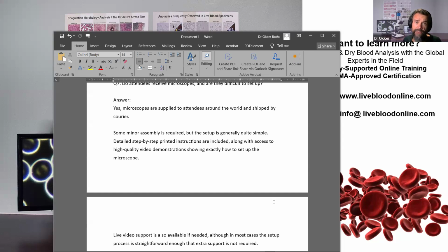In most cases, the results are discussed with the client while they are there in the appointment. The images or the video is displayed on the screen. The client can see, and very similar to the setup behind me, we also have wall charts placed on the wall where clients can see what is going on in their blood on the screen, and they can compare to the images on the wall charts, and that also just adds more credibility.